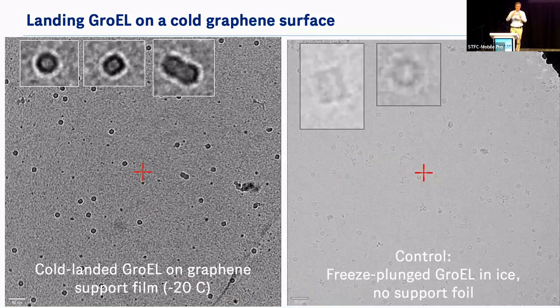On the top view, it's a circular projection. On the side, it's a rectangular projection. It actually looks pretty sharp and really geometric in regular CryoEM. And what you can already see here is that the rectangle is pretty rounded and doesn't look quite right. But very, very high contrast, I hope you'll agree, and I'll show you more examples of this. I should say this is pretty defocused, so you get these fringe-like features around the particles.